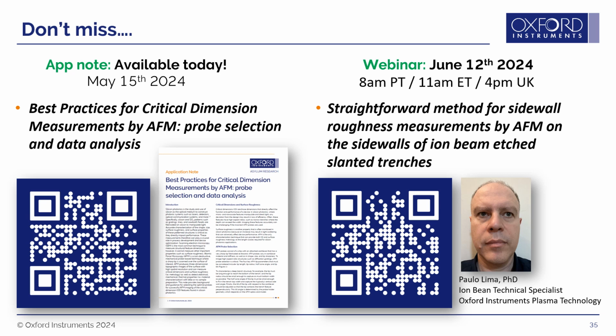That's one of the real benefits of using it: instead of analyzing all of your images one by one, you can really automate a lot of that. Not only does that save you time, but I'd also emphasize that it helps make the results more consistent, so that you don't have operator-to-operator differences, and even differences in how an individual operator might set up the analysis each time they sit down. This way, they're always using exactly the same settings, exactly the same steps.